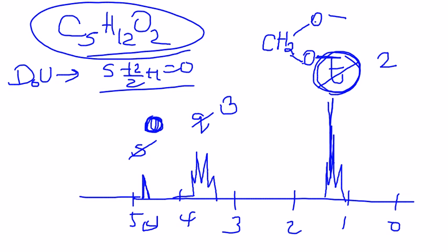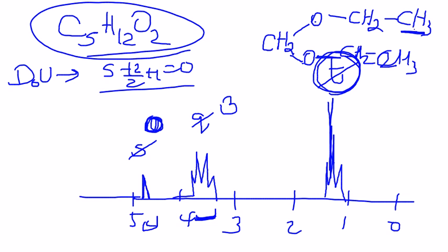So that makes sense. Now that should be connected to, notice the number is pretty deshielded as well, so connecting to 1 oxygen makes sense. And what if that is a CH2 and a CH3? So that would tell you that these 3 protons are going to split the CH2 like a quartet, and the 2 protons are going to split the 3 hydrogens like a triplet.